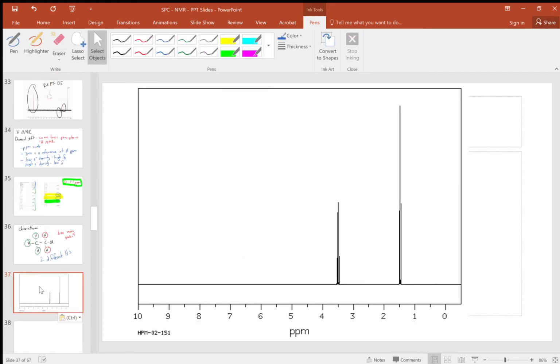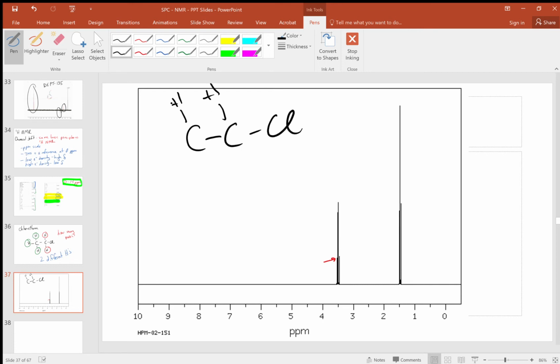And here it is. Now there are certainly two spots where we have stuff in this spectrum, but if you look very carefully, this first peak, which you probably guessed, and let's put the structure back up here, because that's the first thing we should do, is which proton corresponds to which peak. So I'm going to label these as HA and these two as HB.